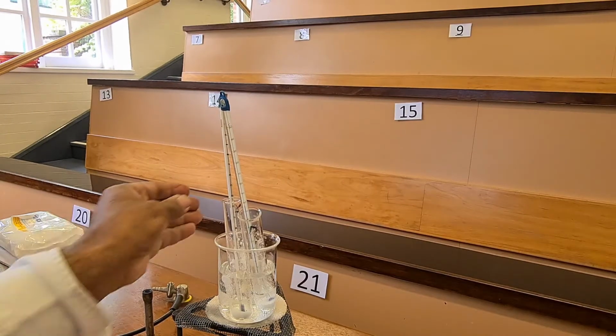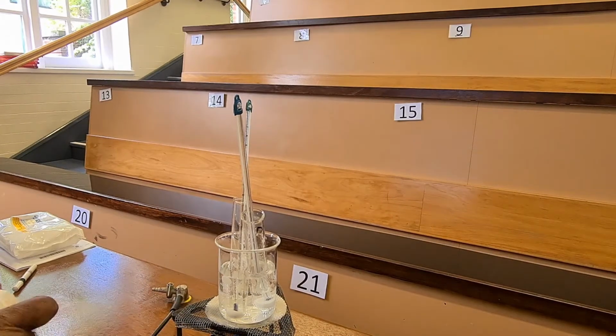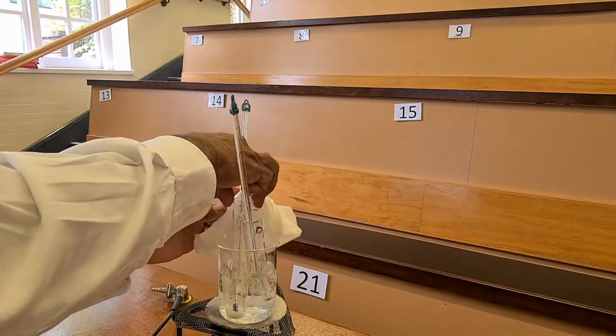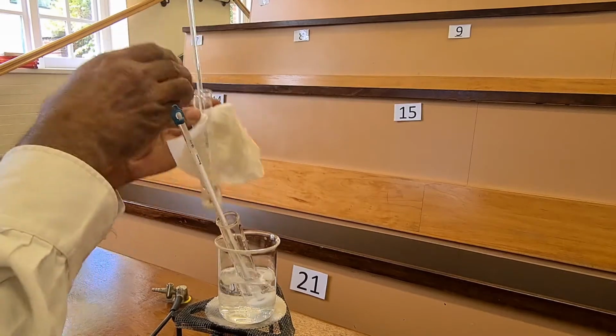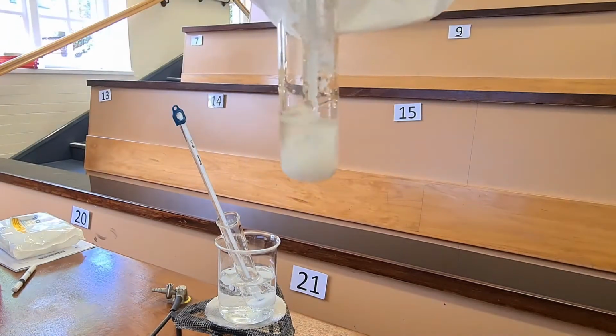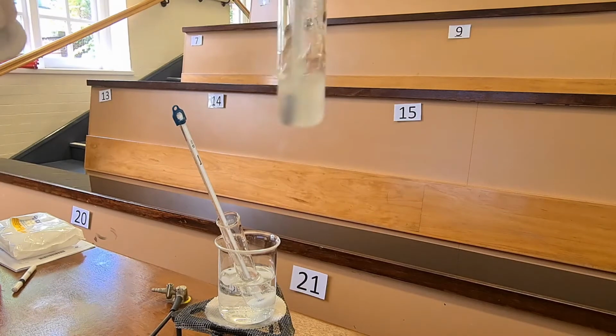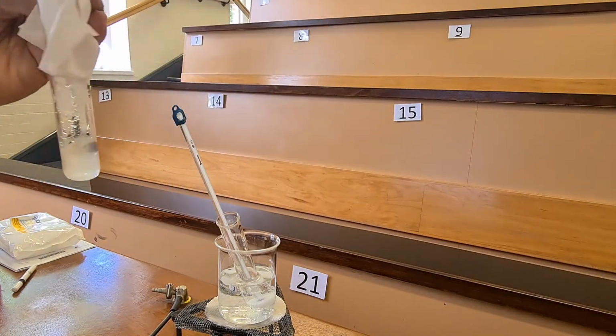Now let's pick up C. Can you see? In C, I've got solid. I'm going to try and dissolve it by stirring it.